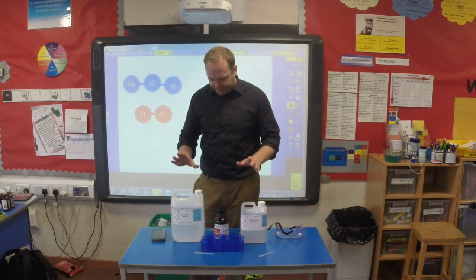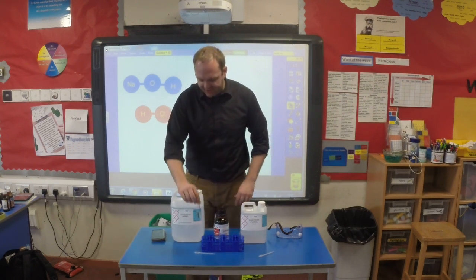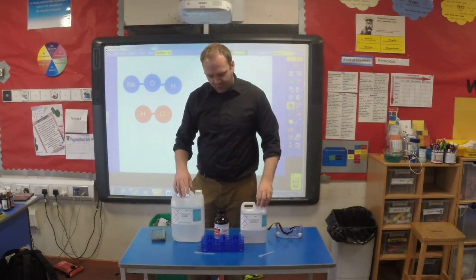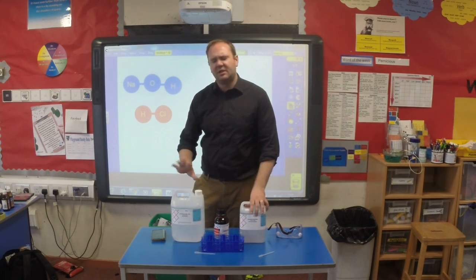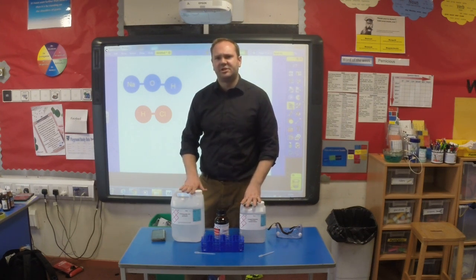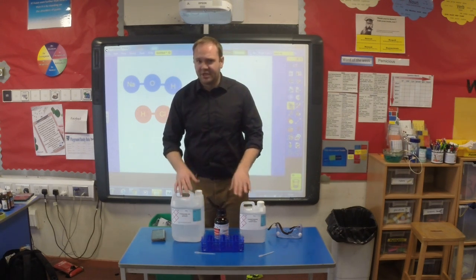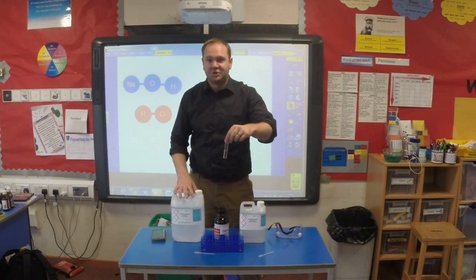So the procedure itself, I've got three solutions here. I have a solution of hydrochloric acid, which is acidic. I've got a solution of sodium hydroxide, which is alkali, and both of these are 0.1 molar. That's really the highest concentration that we want to be using in a primary school setting. So nice low concentrations, no more dangerous for you than vinegar is really. But don't let the kids know that. They are still acids and alkalis and need to be treated with respect. And then I've got just H2O, water.